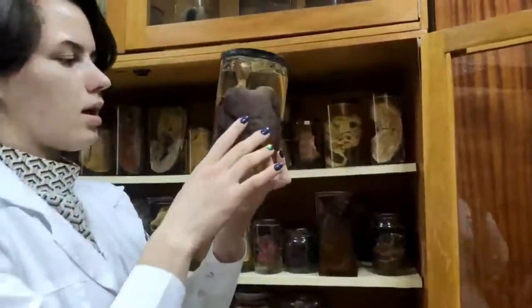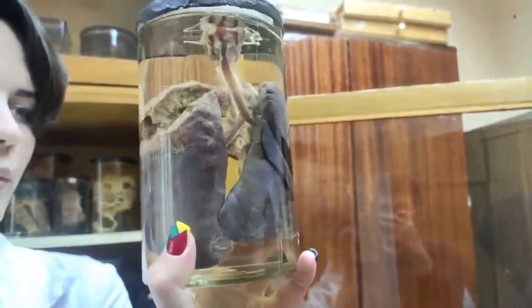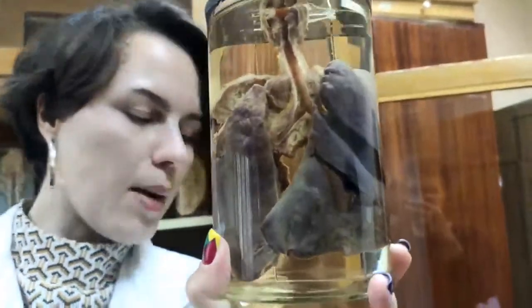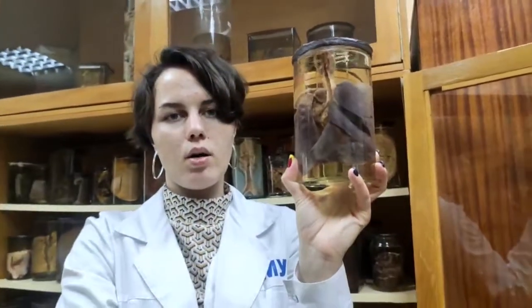The next one is tuberculosis. So, tuberculosis, is it primary with progression? Primary tuberculosis complex. So we discussed tuberculosis a few lessons ago, and you should know that primary tuberculosis complex consists of three elements. First one is primary focus or primary affect.